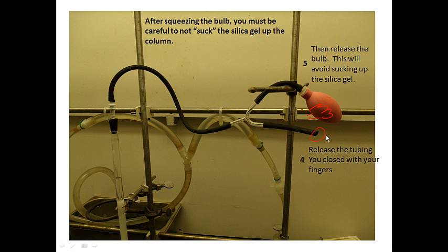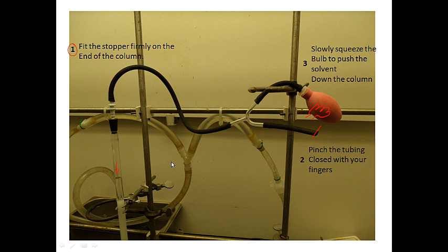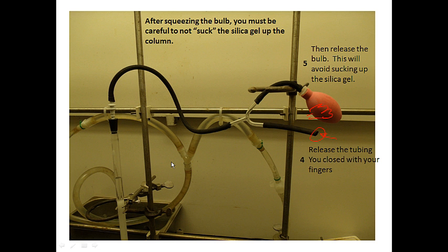It just merely sucks air in from this piece of tubing. So you have to use this process in order to push the solvent. So pinch, squeeze, and then release the pinch and carefully release the squeeze of the red bulb.